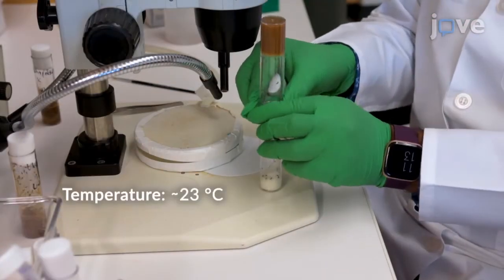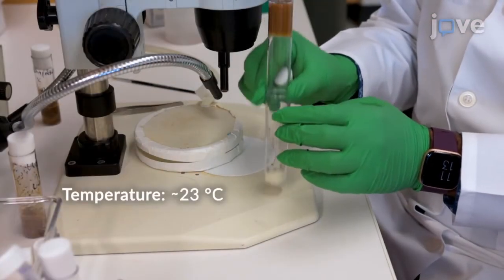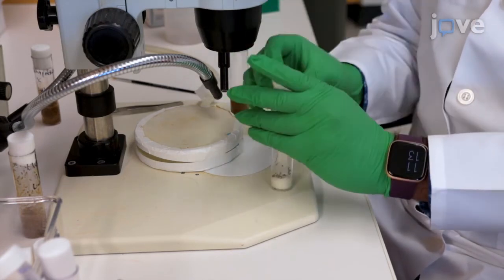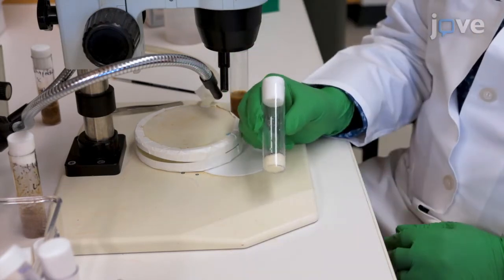Before the experiment, starve the flies for 24 hours at room temperature in a vial containing a laboratory wipe tissue soaked with approximately 2 milliliters of deionized water.